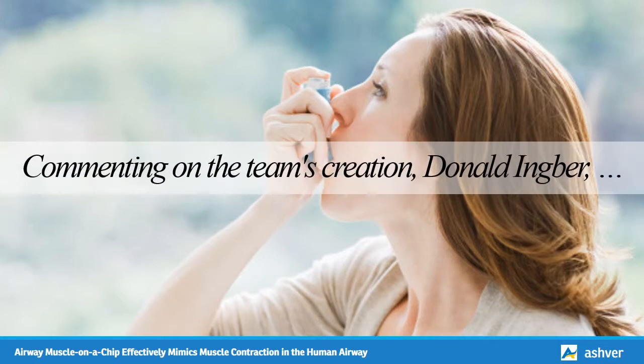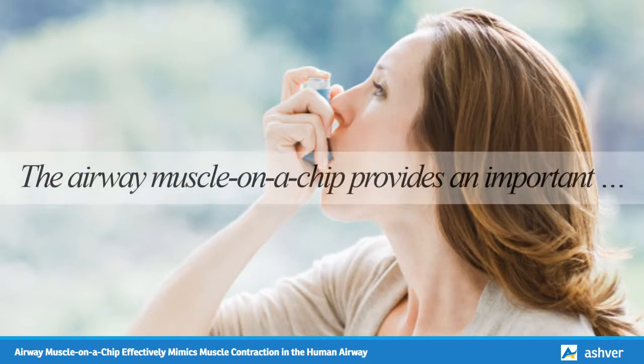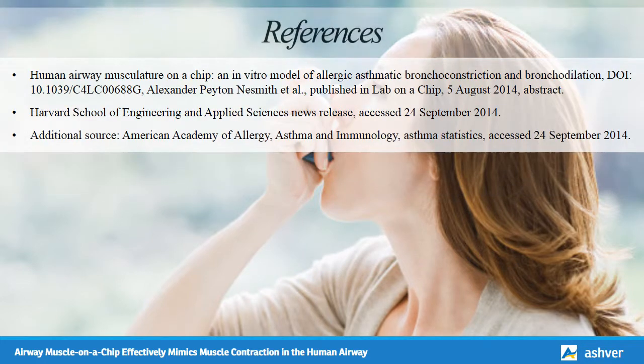Commenting on the team's creation, Donald Ingber, a professor of bioengineering at Harvard School of Engineering and Applied Sciences and founding director of the Wyss Institute at the university, says, "Asthma is one of the top reasons for trips to the emergency room, particularly for children, and a large segment of the asthmatic population doesn't respond to currently available treatments. The airway muscle on a chip provides an important and exciting new tool for discovering new therapeutic agents."